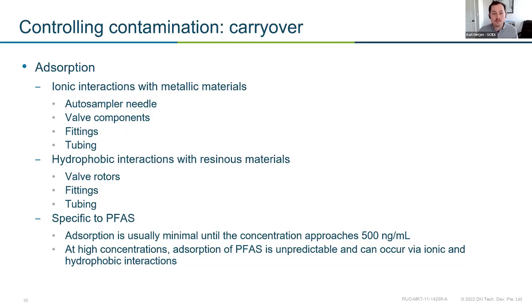This is more of a problem if you're looking for methyl and ethyl FOSAA, which are known to be a little bit sticky with metal. There we can have some contaminant or some carryover issues. That's probably the two that I see more frequently. But you can also have interactions with your valve rotors, your fittings, your tubing, and it's going to depend a little bit on the classes of PFAS that you're looking at.